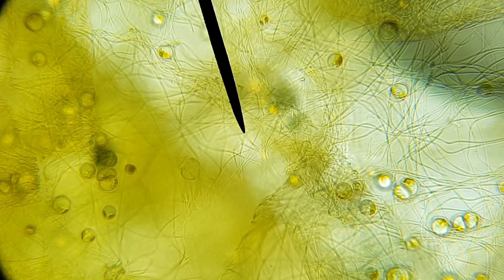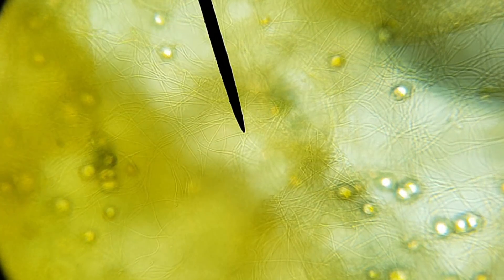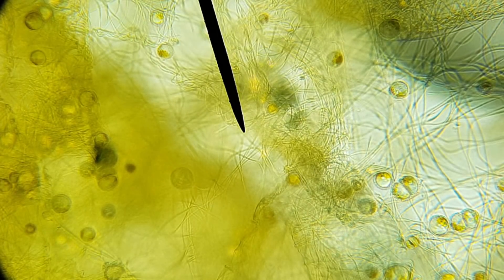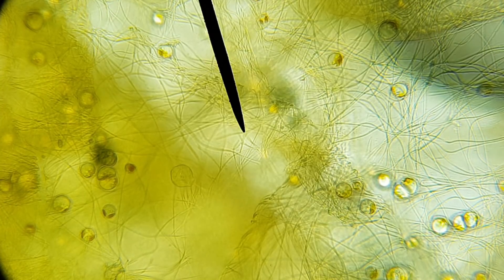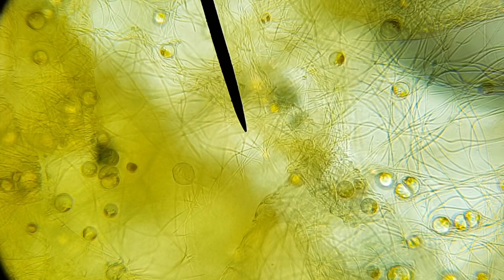This one seems to be a single small vorticella, vorticella, I don't know how to say it. I have no clue what species it could be, but it's the first time I have ever seen one through my own eyes. Well, sort of. So that is pretty special.